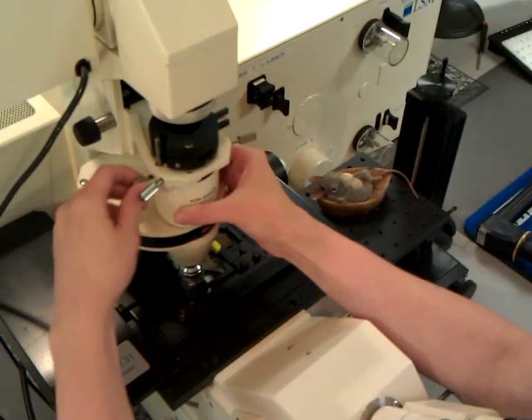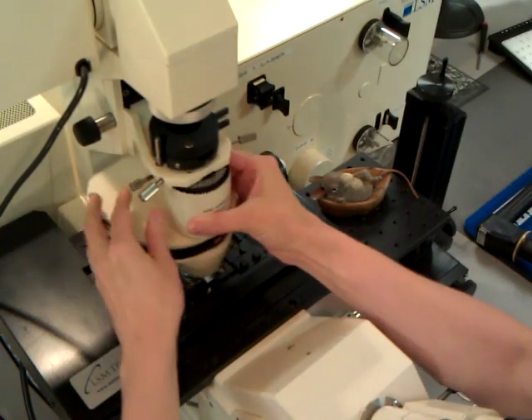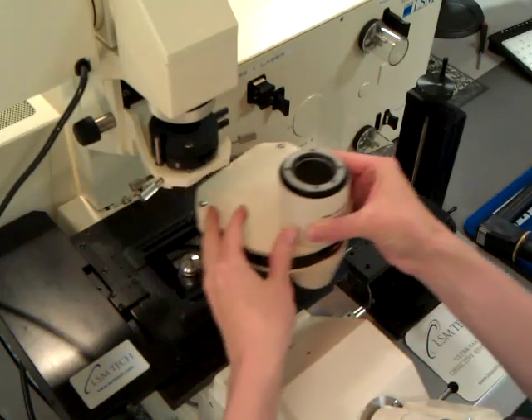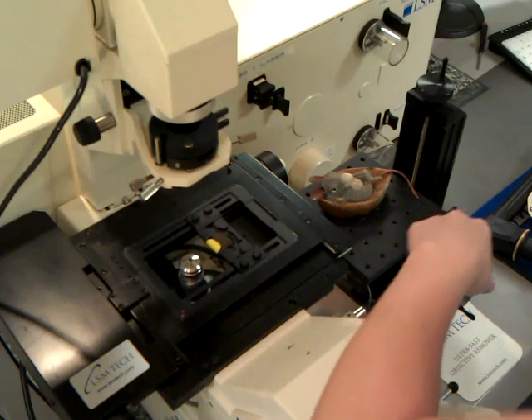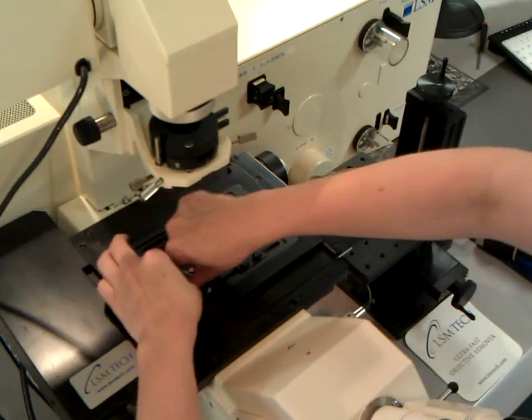This is the installation of the objective inverter on an inverted microscope. First, you remove the condenser and place it in a safe place. Then you remove the objective.